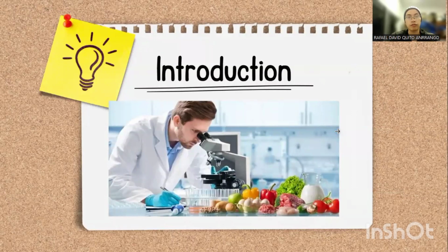In the realm of food safety, ensuring the microbiological integrity of food contact surfaces is paramount. This is where surface swabbing, a fundamental technique in food microbiology, takes center stage. By meticulously collecting samples from these surfaces and subjecting them to rigorous laboratory analysis, we can unveil the hidden world of microbes that may pose a threat to food safety.